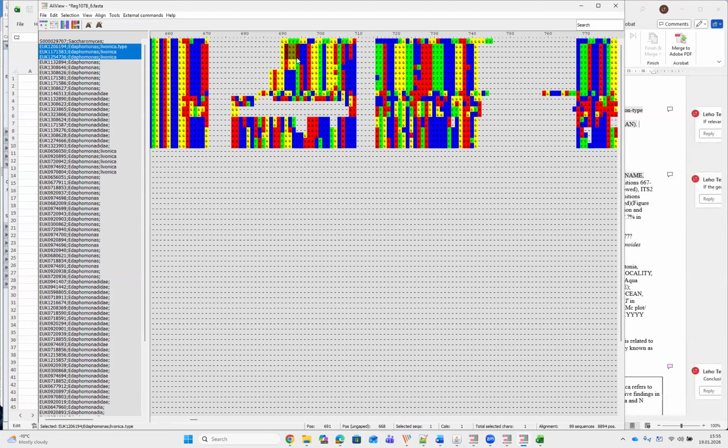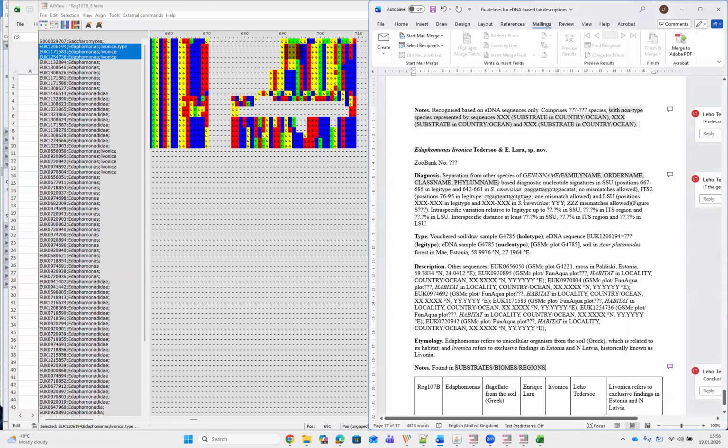The fourth A nucleotide is very unique, and the sixth T nucleotide is also quite unique. So let's mark the second to sixth nucleotide with underlining.